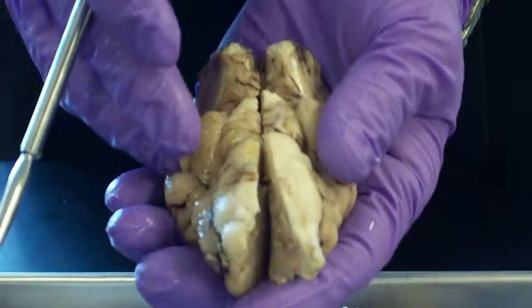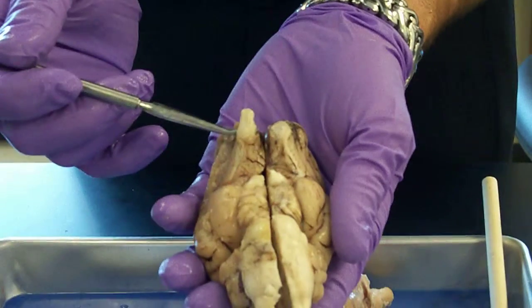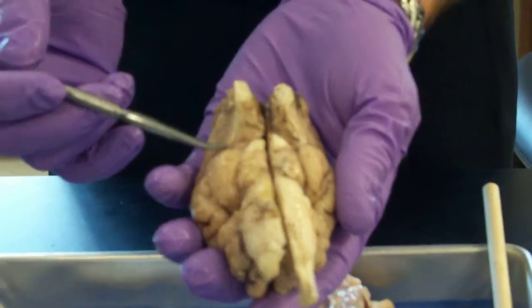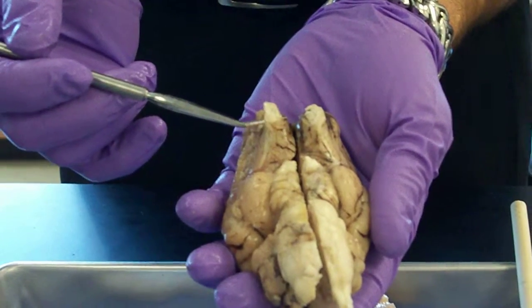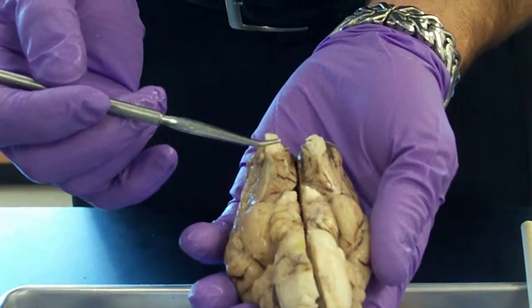Olfactory bulbs. If we put the brain back together and look at the bottom of this frontal lobe, we can see those olfactory bulbs there. Then they kind of narrow down into olfactory tracts that go this way. Olfactory bulb, olfactory tracts. We saw the longitudinal fissure on top.